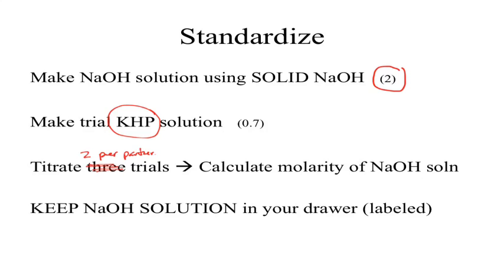Okay? We do not have to know the exact molarity of the NaOH to continue with the experiment. Okay? Because we know what it is approximately already. That's why we measured out 2 grams. Okay? So you don't need to know that number to start the pH titration. At this point, you would officially be done, so you could go home and calculate it.